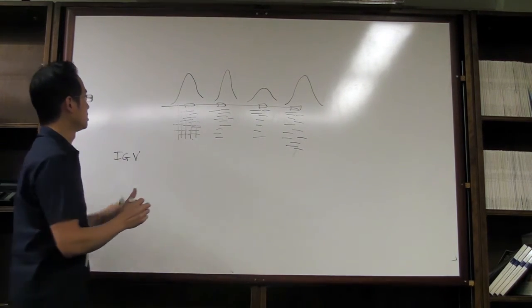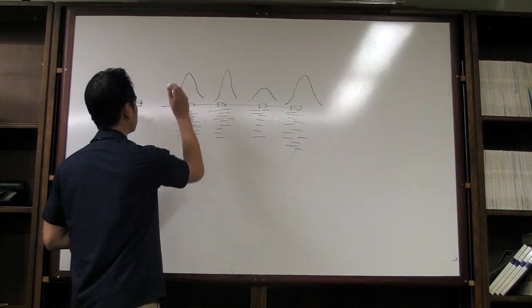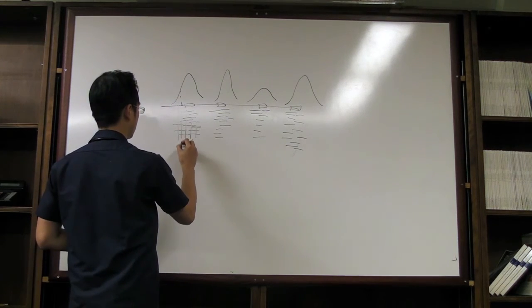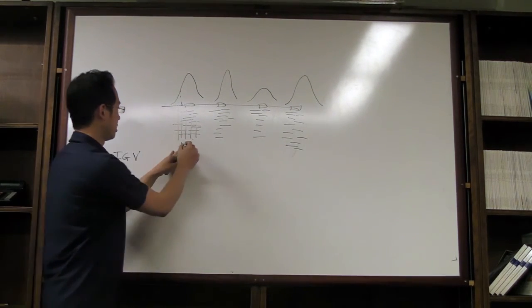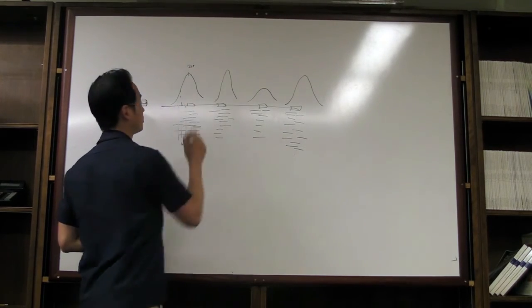So coverage is, I take this one A, for example. How many reads cover that A? I have here 100 reads that cover that A. So that's 100x coverage. In the peak here, I have something that is 200x coverage.